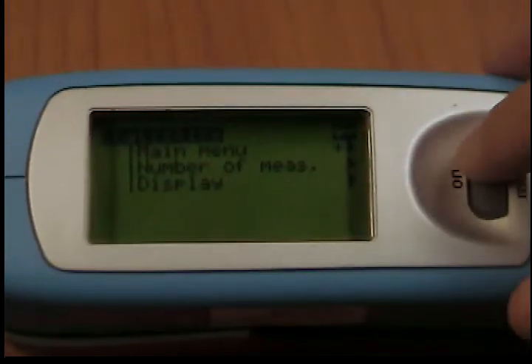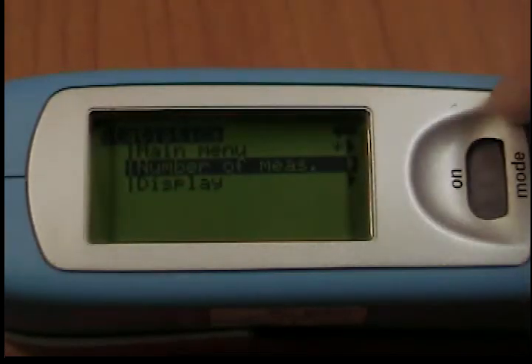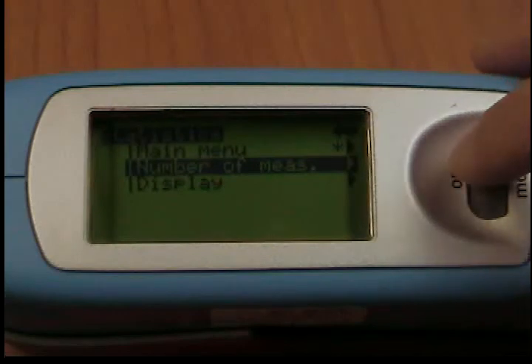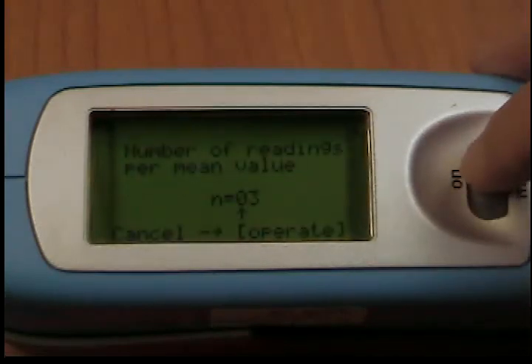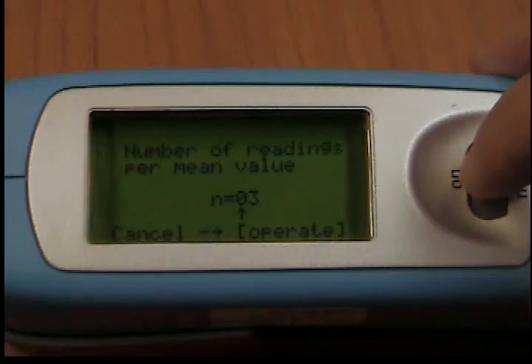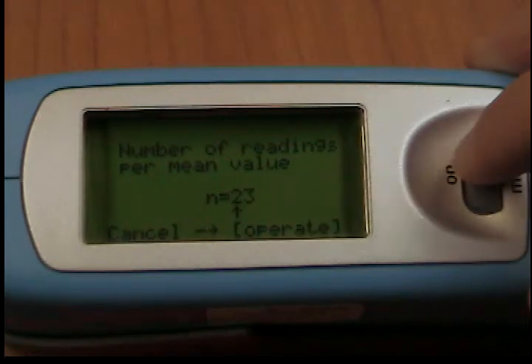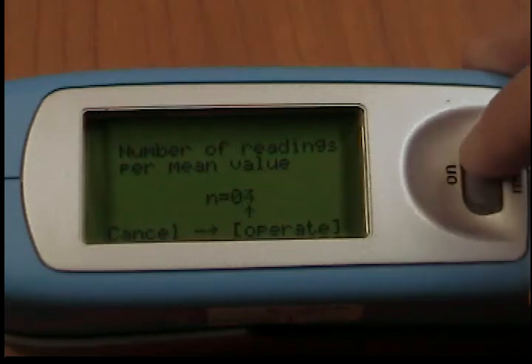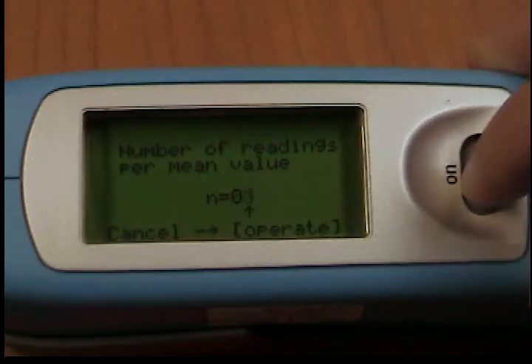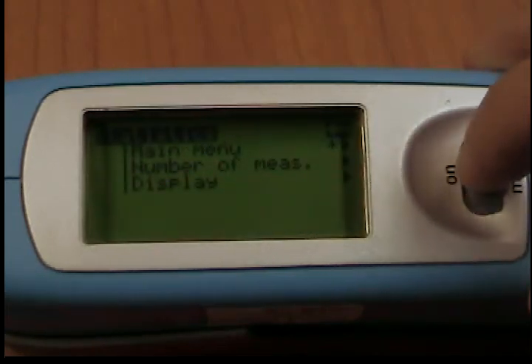You can adjust the number of measurements per sample or per block with this option, from 2 to 99. You can find this value in the measurement display by looking for n equals after the forward slash. The number of measurements, which increases by 1 each time a measurement is performed, appears before the slash.